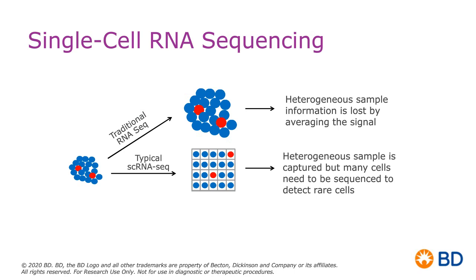And we soon realized that we thought this technology would be leading to all of these amazing discoveries, and instead, it was just kind of ho-hum data. Sometimes we would get things that were interesting, but it didn't give us the results that we were looking for. So what then happened is people would start saying, well, let's do single-cell RNA sequencing. Let's do serial dilution so that only a single cell would fall within a well, and then we're going to do sequencing of the RNA for all of these individual wells.